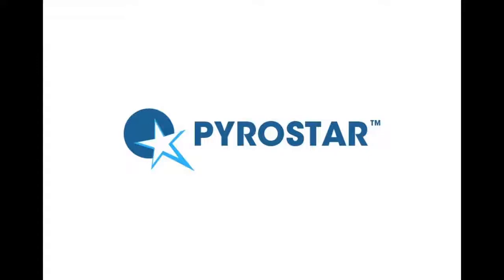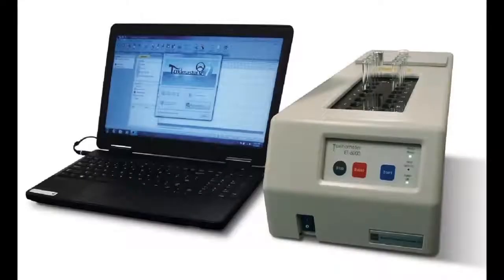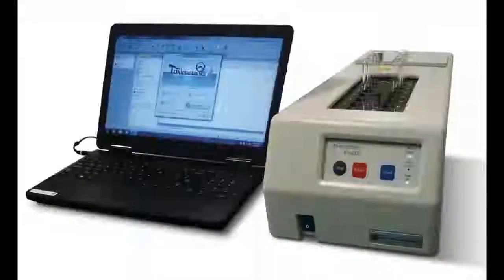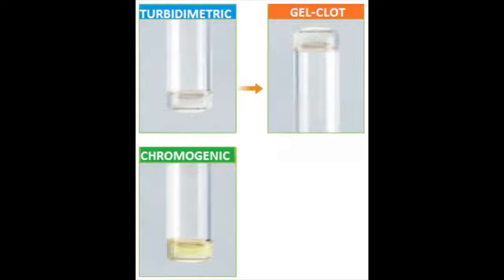Our LAL products are formulated to be used either qualitatively as a gel clot reagent or quantitatively as a kinetic turbometric reagent. The Toxinometer ET6000 allows for measurement by turbometric, chromogenic, or gel clot method.